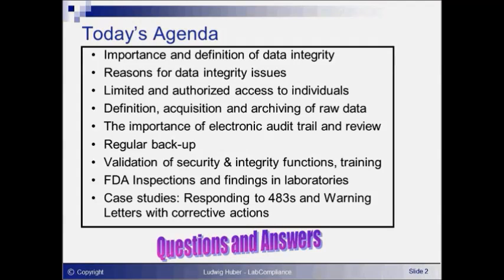Then I will talk about validation of security and integrity related functions. And finally, I will go through a typical FDA inspection and talk about typical findings in laboratories. I will finish my presentation going through case studies and also tell you how to respond to 483s and warning letters. After we have probably not managed to avoid getting a 483 or warning letter, at least we should have a good follow-up to minimize further damage.